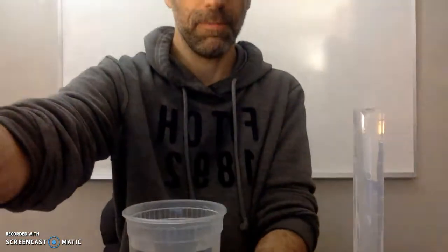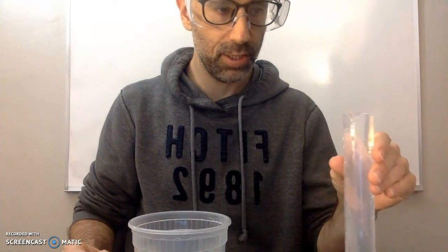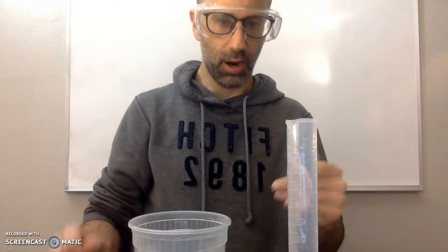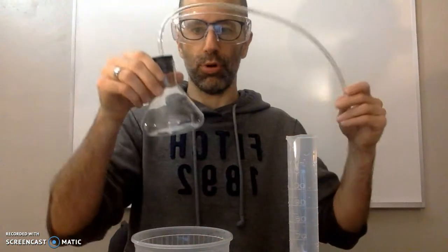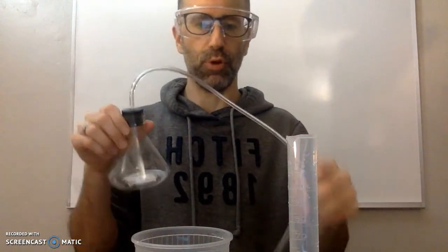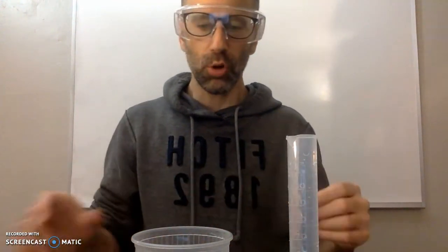You'll also need your graduated cylinder. You'll see that the graduated cylinder already has water in it — I've filled it all the way to the top, with water coming above the rim. The reason for that is you want as little air in the graduated cylinder as possible, because the whole point is you're going to be collecting air through a tube into the graduated cylinder.